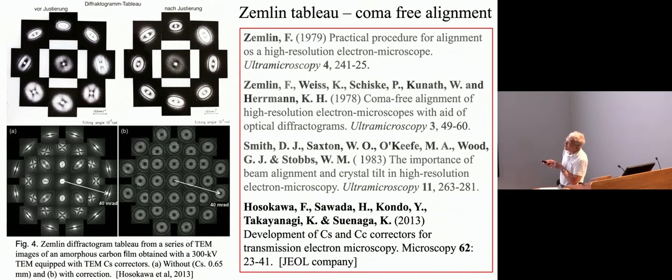So here on the left, top left, is a computed diffraction pattern of an image. In the middle is a sort of near focus one with the astigmatism corrected. And then you tilt the beam by, say, 10 milliradians one way, and you're putting the beam in a specifically non-parallel position, and you get a perturbation of the pattern. You go the other way, and you should get the inverse of that, but you don't. You see, you go up here, and you go down. So that shows you that this central image does not have the beam going vertically.